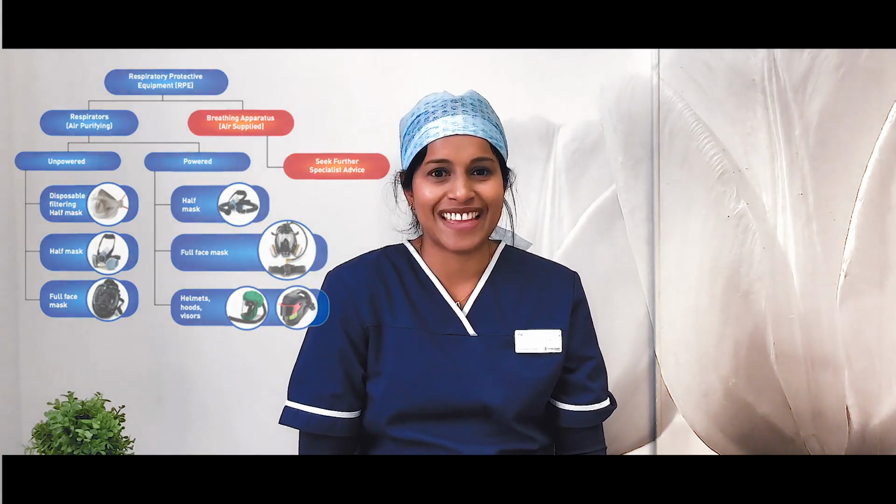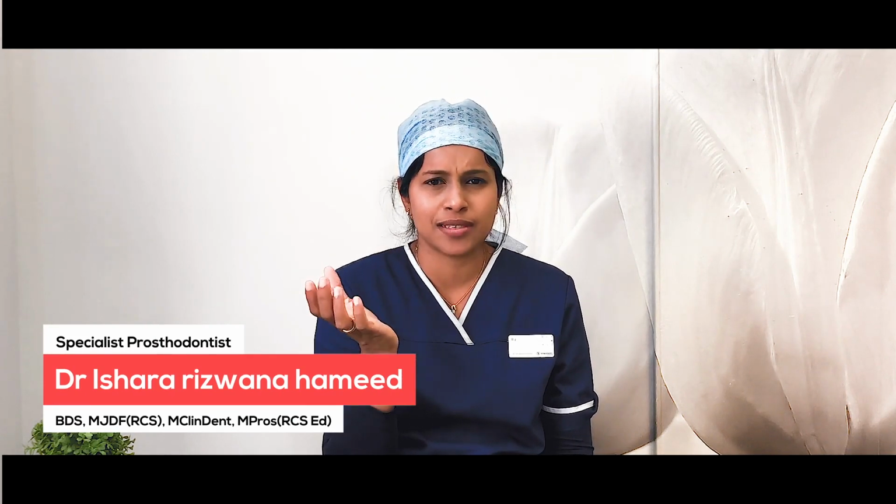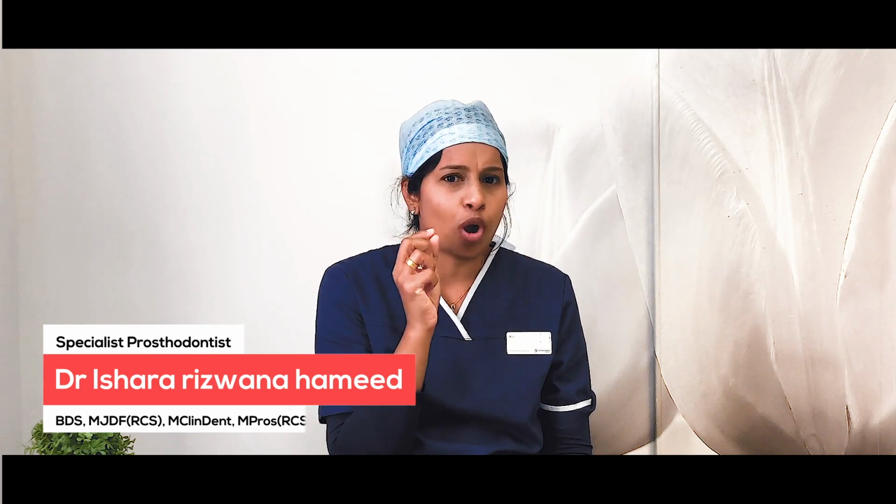There's a half face shield mask, there's a full face shield mask, and a hood type, which I will demonstrate to you at the end of this video. As explained in the previous video, the corona particles are about 0.1 microns. So if you look at all the respirators, you can see that it mentions the particle filtration of 0.3. I don't know if you've really noticed that.